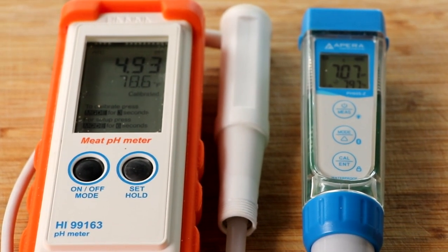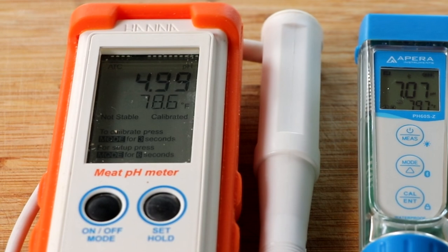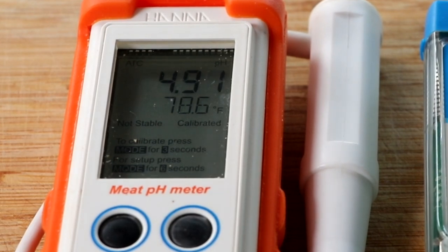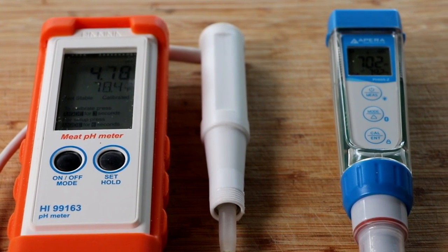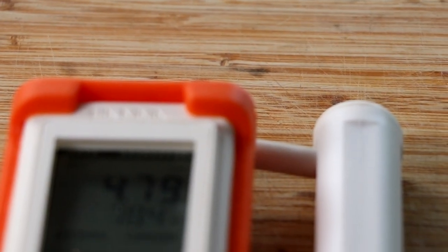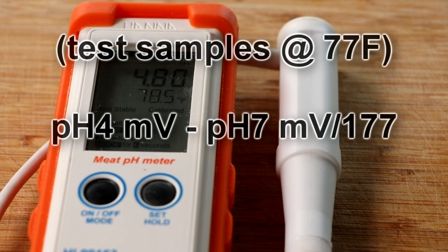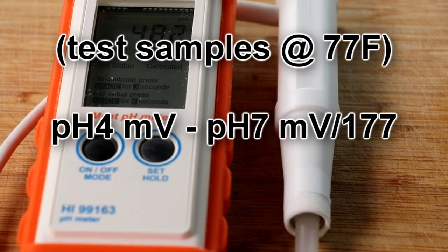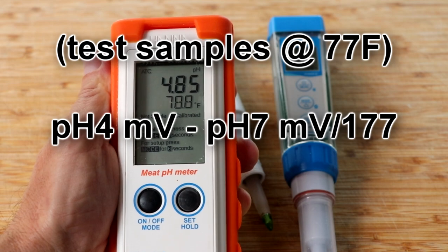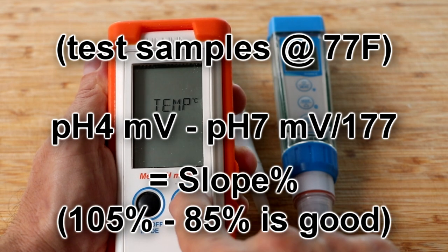I've got one of your pH meters here, the 99163. How do you find the slope on that particular meter? Unfortunately you cannot — it doesn't give you any millivolts or anything so you're not going to be able to do any type of slope calculation. The newer style actually has a millivolt reading so you can go in and measure the millivolts and manually calculate your slope if you wanted to. So if you calibrate it to 7 and 4, for example, you would measure the pH 7 solution and write the millivolts down, measure the pH 4 solution and write the millivolts down, subtract the two, and then divide that by the theoretical value of the millivolts for pH 4, which is like 177 at 25 degrees C, and then you'd get a percentage that way.